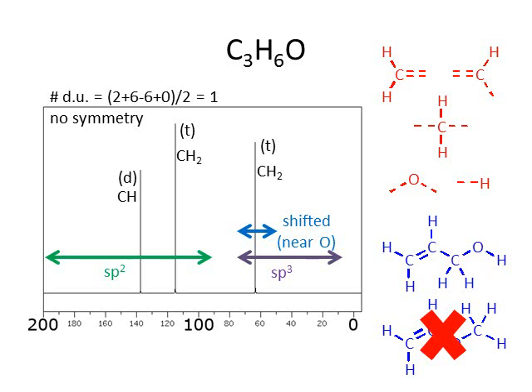I don't, in this case, have an IR, but I don't need one, because I've put together the pieces in the only possible ways that they could go, and by process of elimination, I've decided that this must be prop-2-en-1-ol, or propenol. And that's my only possibility.